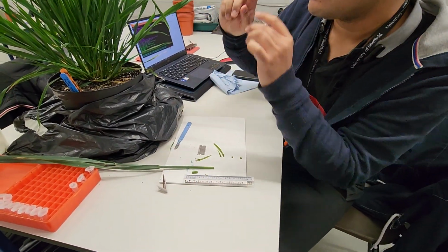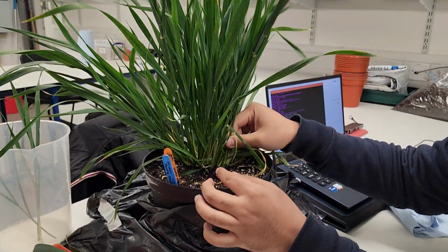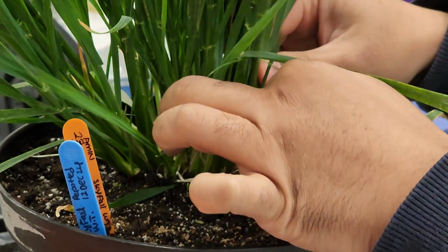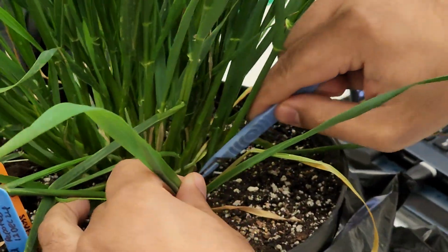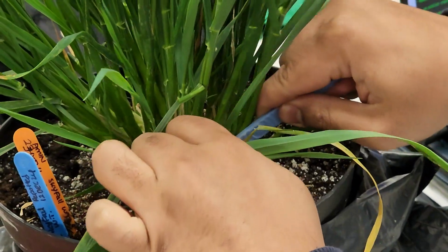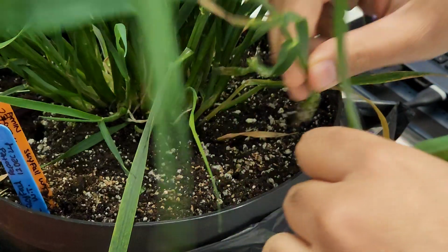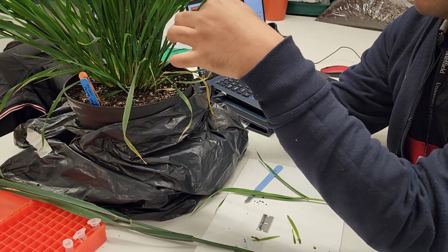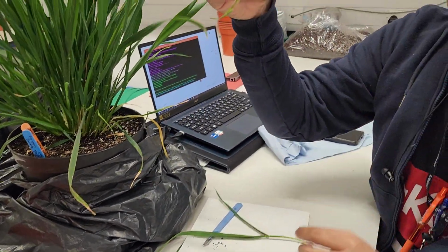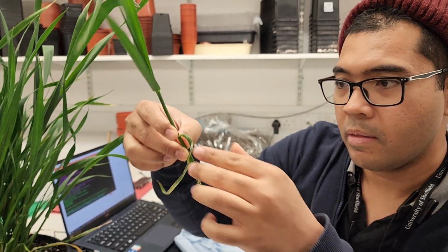Right. Let's get a tiller without stem elongation. I hope there is still some. Yeah, maybe this one. This one here. It's a good thing we got the whole bush of this plant. Can you get a beaker with water? I need to rinse this. Just a small beaker. Right. Okay. I think this one should be a good one.